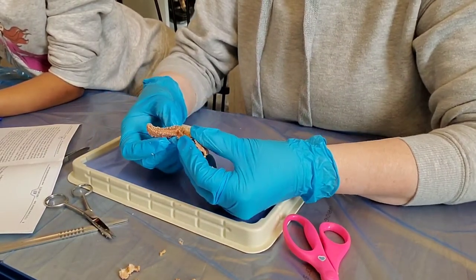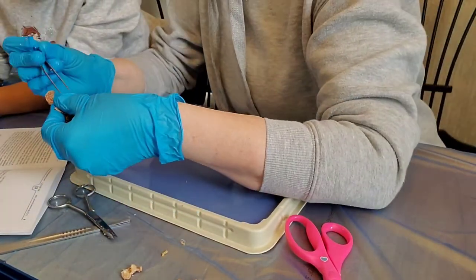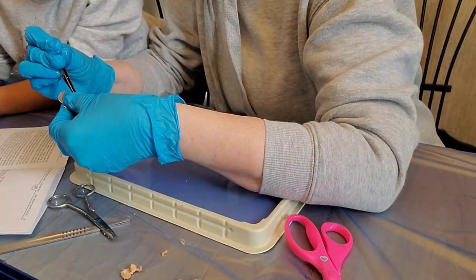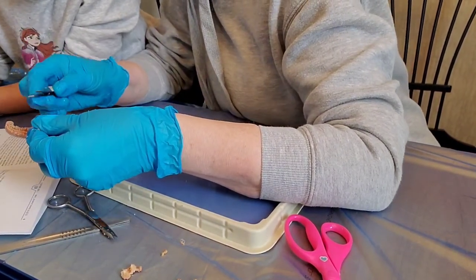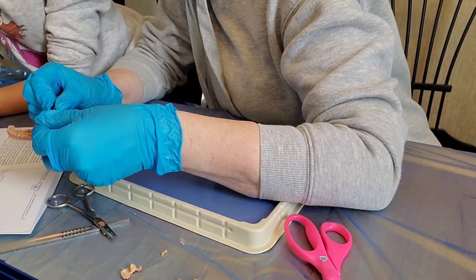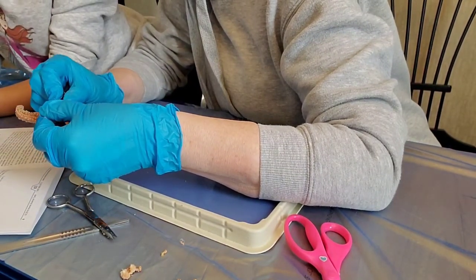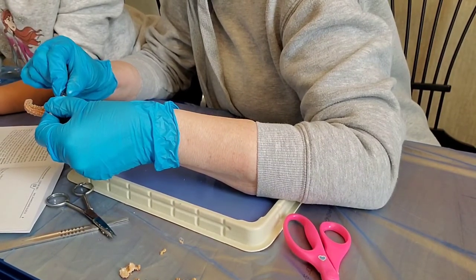All right Hope, right here — take a look. Let's get this stuff out of the way now that we've got a good look. See right here — this is the ring canal. You can see the little hole right there.